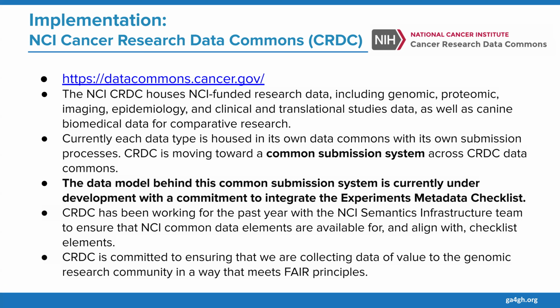The data model behind this common submission system is currently being developed, and it has a commitment to integrate the experimental metadata checklist for everything that pertains to sequencing experiments. The CRDC has been working for the past year with the NCI semantics infrastructure team to ensure that NCI common data elements are available for and align with checklist elements. And CRDC is committed to ensuring that we collect data of value to the genomic research community in a way that meets FAIR principles.